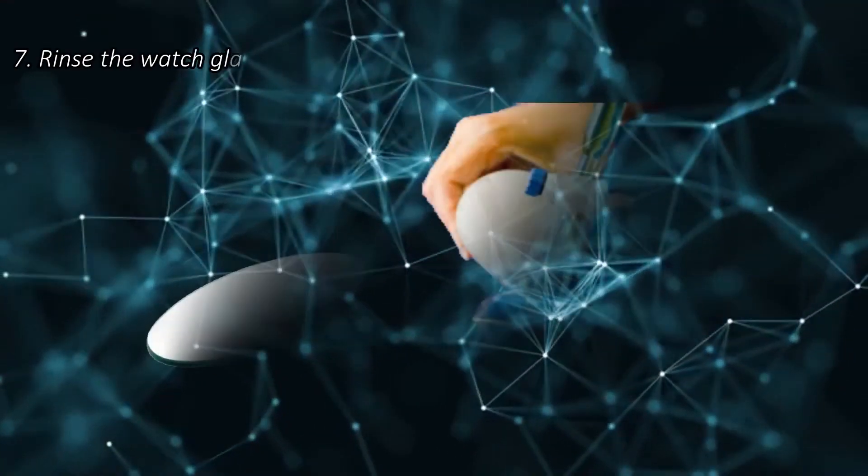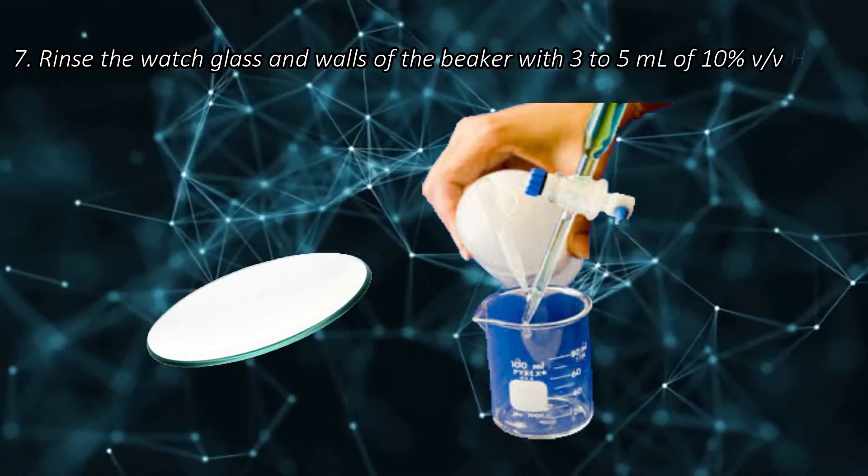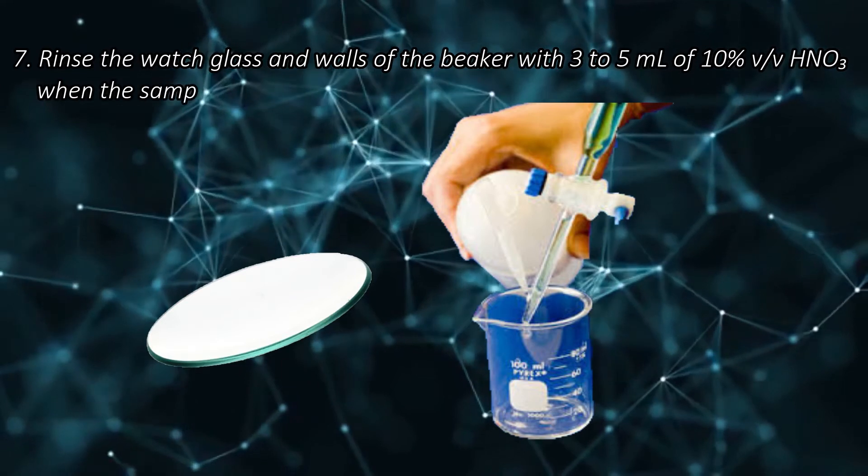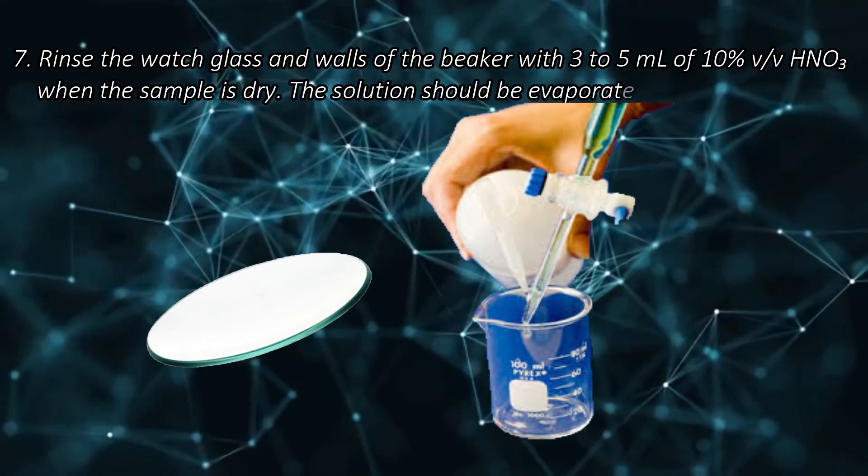Step 7. Rinse the watch glass and walls of the beaker with 3 to 5 ml of 10% volume-over-volume nitric acid when the sample is dry. The solution should be evaporated to dryness.